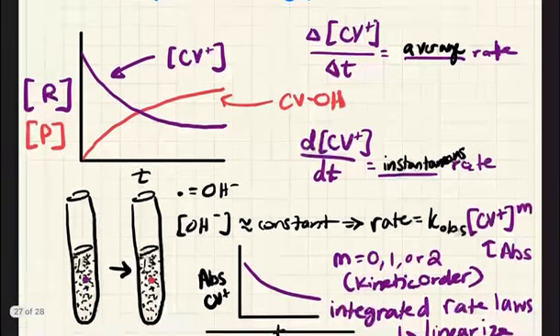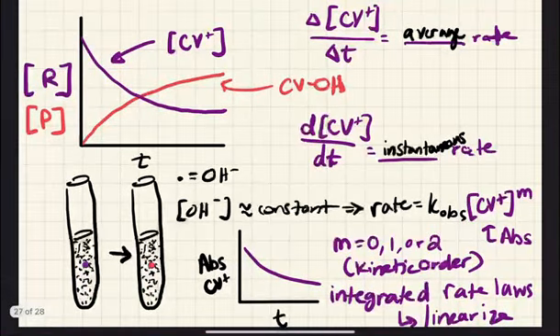in this experiment, which is to look at instantaneous rates, but we're going to think about the instantaneous rate at all points combined in a sense, because we're going to be more focused on what the overall shape of the graph is and how we can consider it to be linear. And so to simplify our rate law so that we can actually make these approximations, we're going to prepare our solutions in a way where the hydroxide is at a really high concentration compared to our crystal violet.